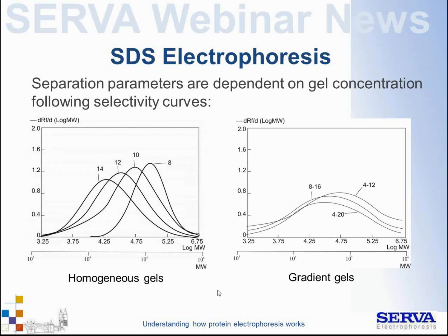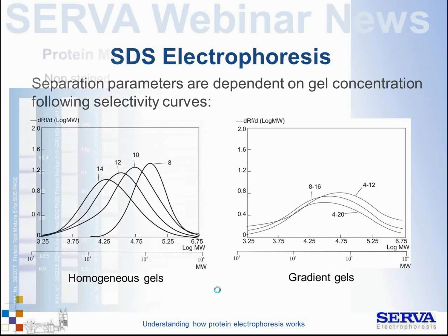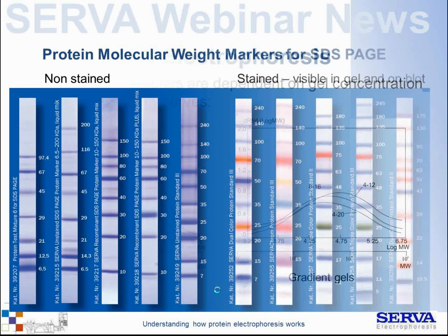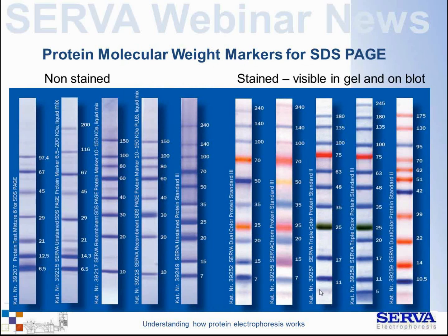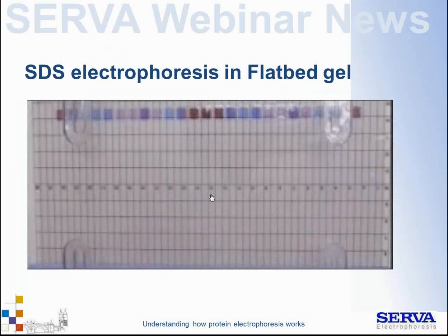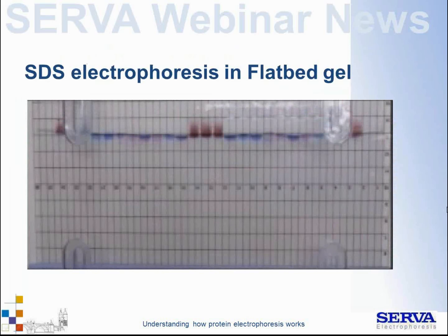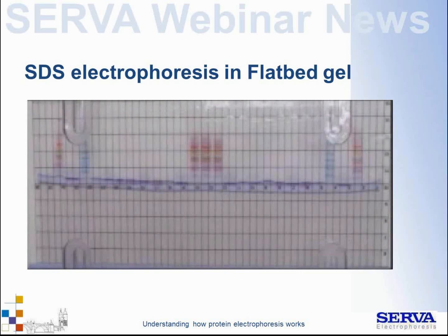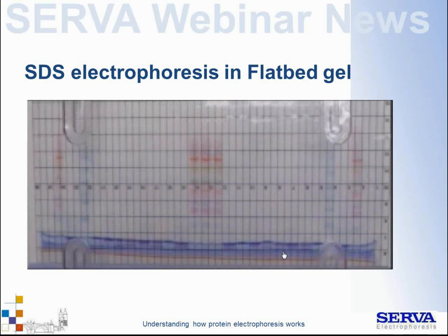To interpolate molecular sizes, molecular weight markers are used. These include non-stained markers and pre-stained markers, allowing you to monitor separation progress during the run. Fluorescently labeled markers and dual-color markers (both dyed and fluorescent) are also available. A short movie demonstrates how the band pattern develops during a real horizontal SDS electrophoresis separation.